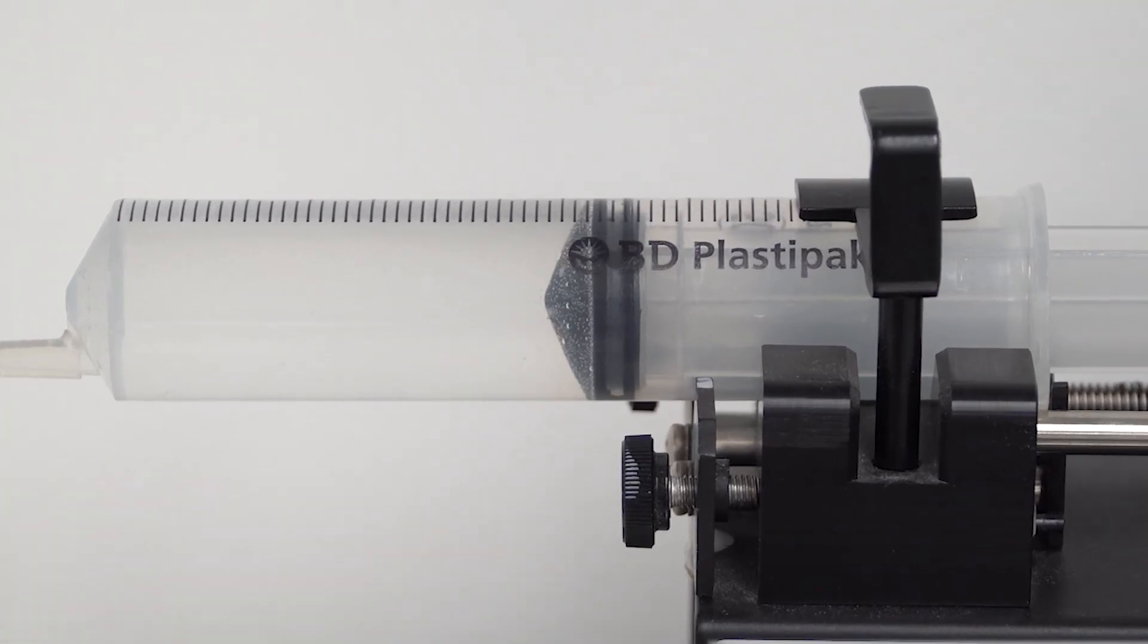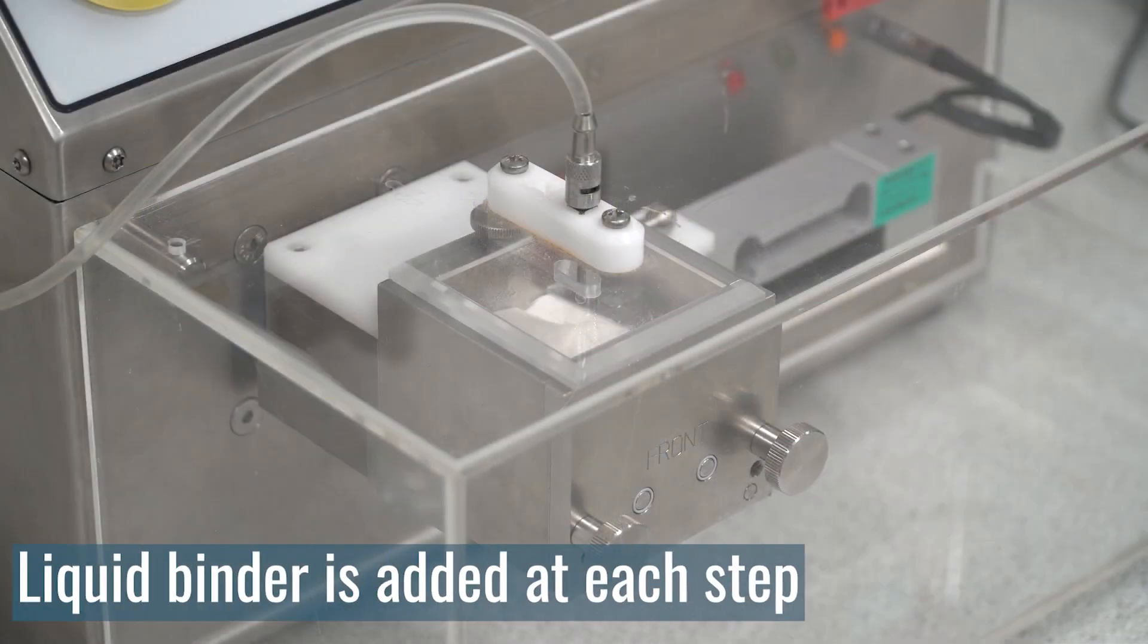The multiple addition test is a multi-stage experiment where liquid binder is incrementally added to the material inside of the mixing chamber.